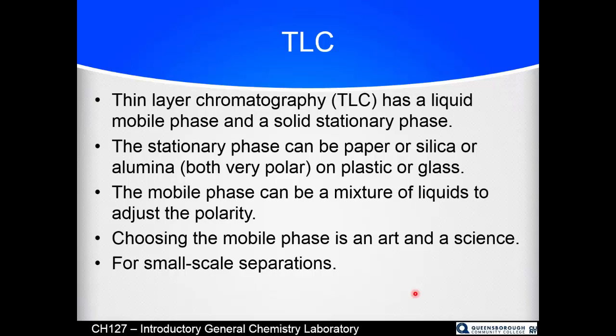The mobile phase can be a single component liquid or multiple components making a mixture of liquids. And you're choosing your mobile phase to hopefully get perfectly good separation between your components. And therefore, it's both a little bit of art and a little bit of science. Tailoring your mixture, perhaps, to get good separation of your components can be a real challenge. We give you the mobile phase already mixed for you, so you don't have to worry about that art and science, and just see how well you can separate your components of an ink pen.